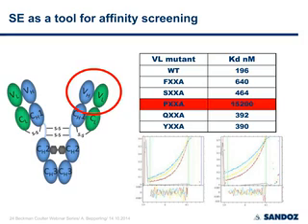Most of the mutants were not that dissimilar to the wild type, but when we mutated a proline residue, the KD got much worse, from the 3-digit nanomolar range to about 15 micromolar. And you also can see it by eye. This is the high affinity interaction with more complex forming, and this gradient is more shallow with more free A, free B in there, so barely interacting.